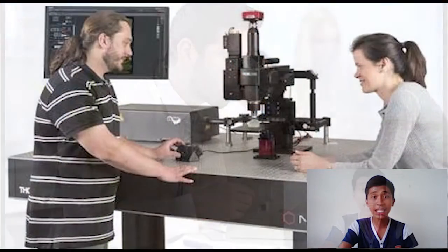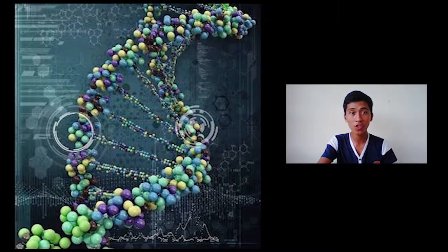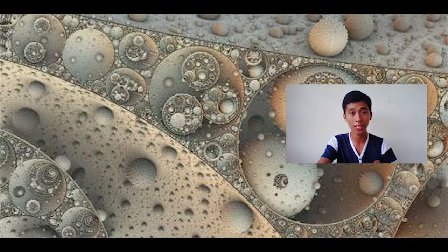What is a microscope? It is an optical instrument that uses a lens or a combination of lenses to produce magnified images of small objects. Scientists and engineers use microscopes to analyze materials and explore the microscopic universe. When we say microscopic universe, these are the objects that are too tiny or too small to be seen by our eyes. Through this kind of tool, we can look at things as tiny as our blood cells or get up close and personal with an ant.